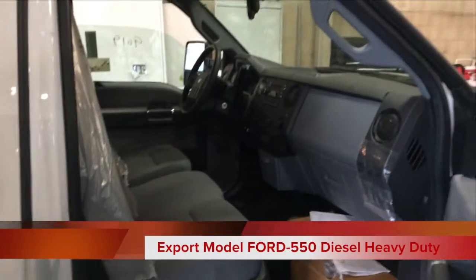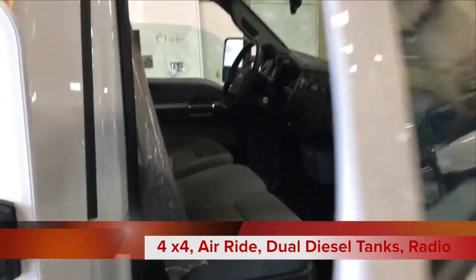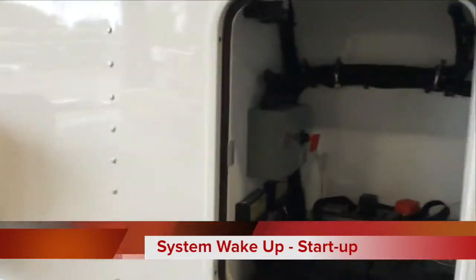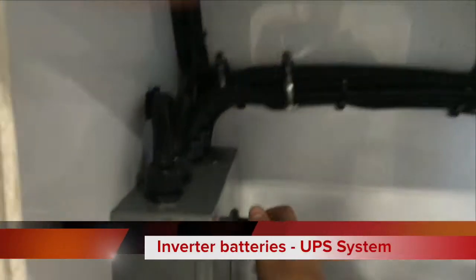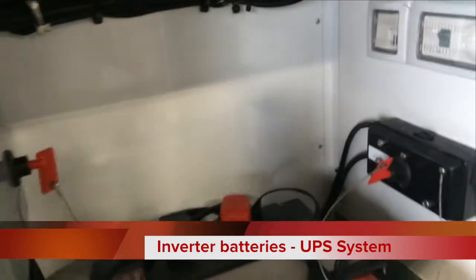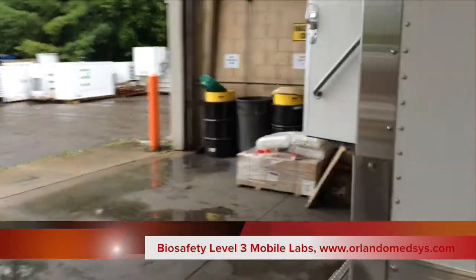This is the interior of the Ford F550. To start the Mobile Lab, simply go into the battery compartment and switch on the 24 and 12-volt, then enter the lab.